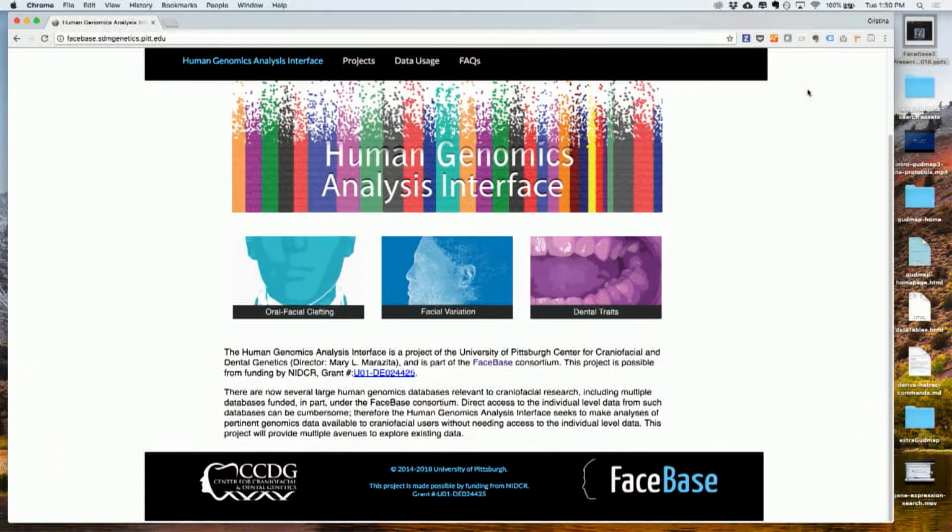And it is available through the Resources tab on the Facebase website or through the project page. Whoops, I probably misspelled something. So either the project page or the Resources tab on the front page of Facebase. Okay, so this is what the basic landing page looks like.